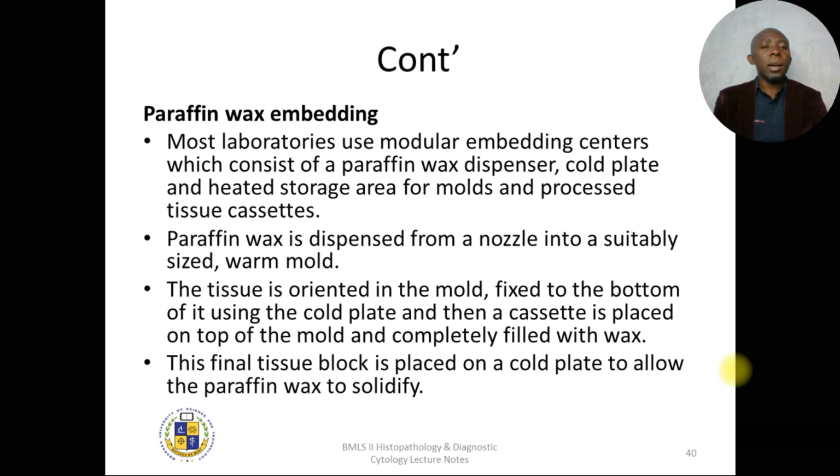So the best, or what is routinely used as an embedding medium, is paraffin wax, just like we preferred it when we were doing impregnation, because it is the most preferred for impregnation in histology. And now even in embedding it will be the same, because we said what we use in impregnation must be the same so that we don't form layers and we don't cause separations.